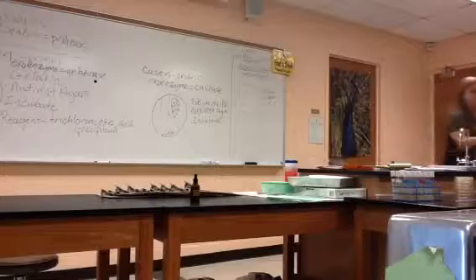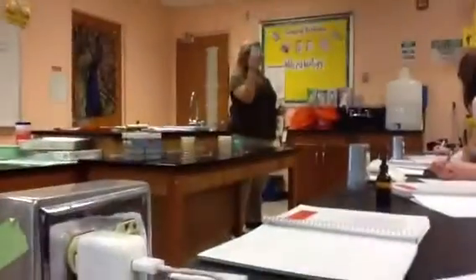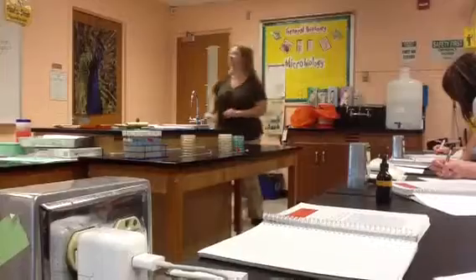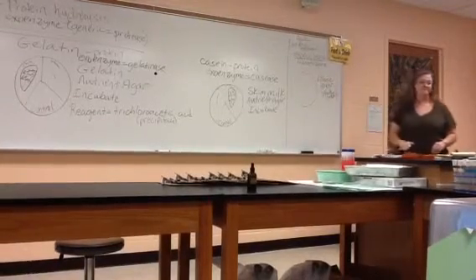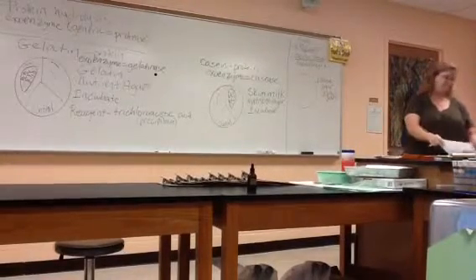This is a real pretty green one. They put methyl green into the mix. That's the green color. They basically stained the DNA green. There's DNA in here. Methyl green is already in it. That's two words. Yeah, methyl green's two.